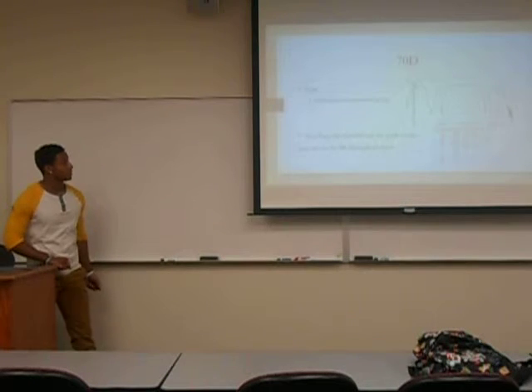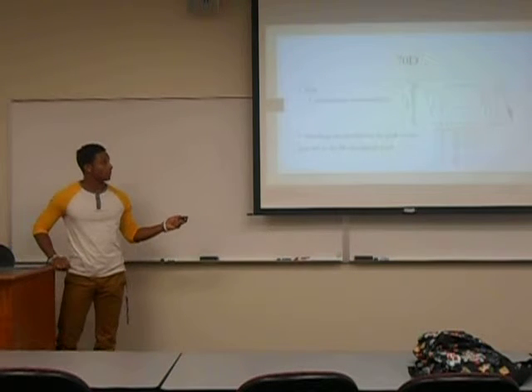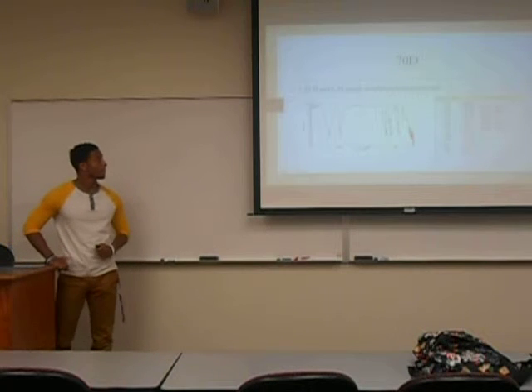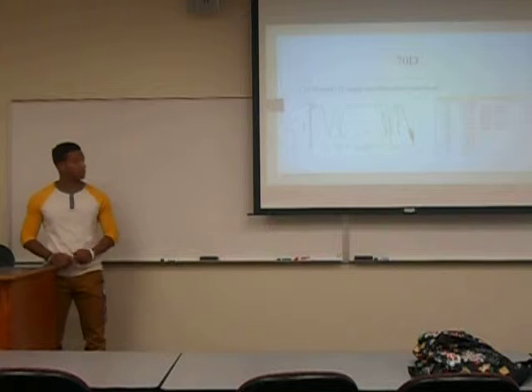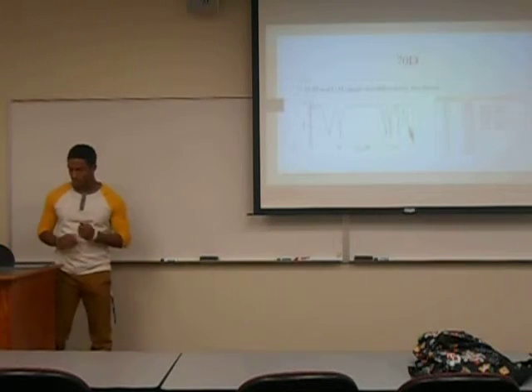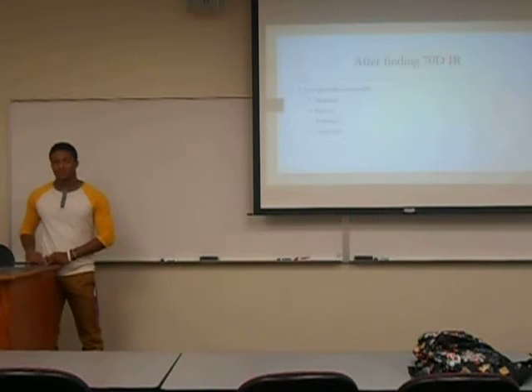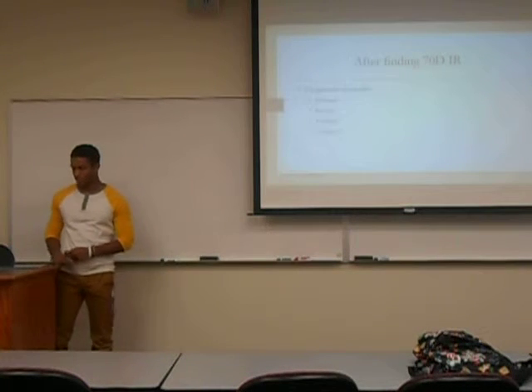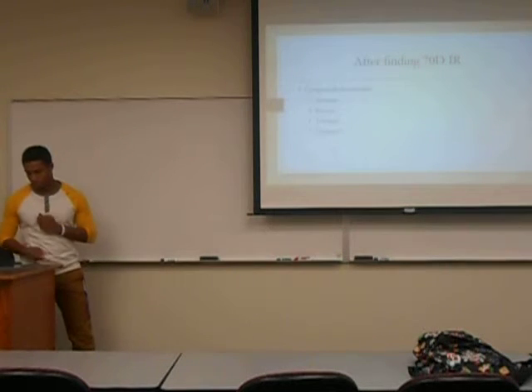So first we had to determine the functional group, and we did this by matching the numbers found on each peak to the numbers found in the IR chart. For 70D, the compound we found was OH, CH, and that was a single bond carbon. After finding the 70D IR, we were able to consider 4 different compounds, and this was methanol, ethanol, T-butanol, and 2-propanol.